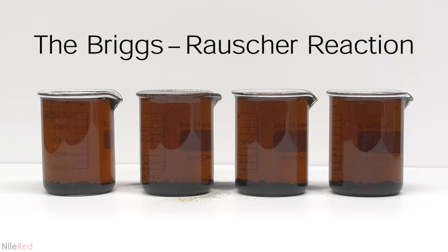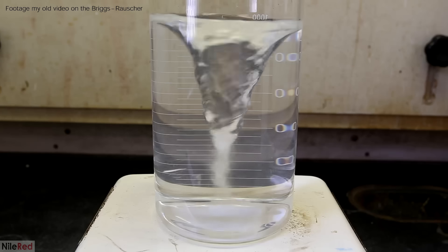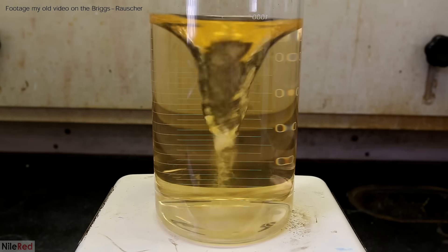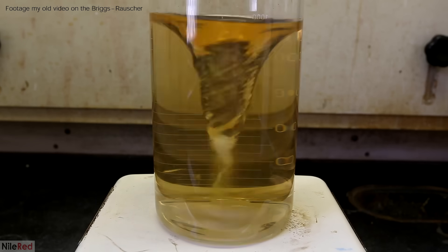Today we're going to be talking about the Briggs-Rauscher reaction. This reaction is quite unique because it's one of the very few oscillating chemical reactions that we know of. Three colorless solutions are mixed and it slowly becomes darker and darker yellow until it suddenly turns black.